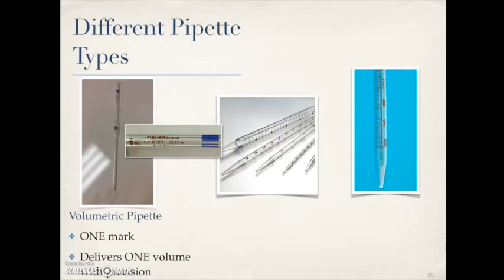We know that when water changes its temperature, it changes its density, and thus the volume will change. It also talks about how precise this instrument is. It can measure that 8 milliliters within 2/100ths of a milliliter, so a precise instrument. We need to make sure that we know how to use it carefully, which we will.